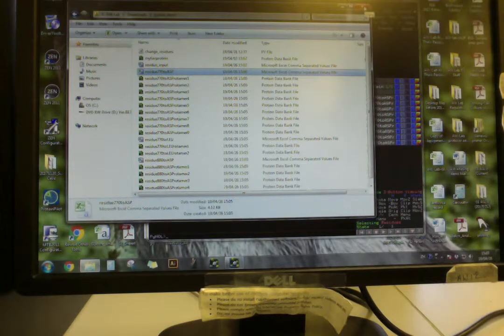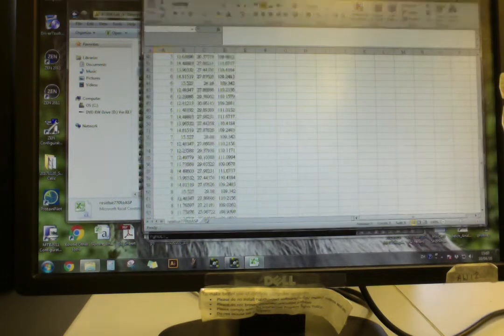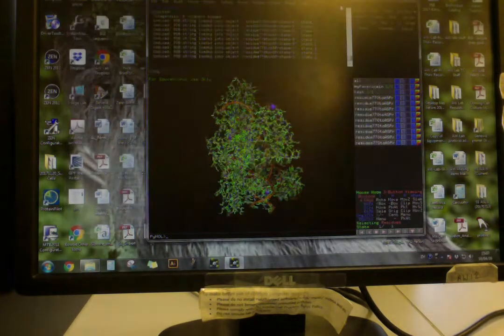And so these are the states of the residue. When you choose rotamers, you press the left and right keys, and these are the states, all of them, out here. There are 9 states, and I inputted the 9 states, shown in PDB file format in here. Then I put it in here.